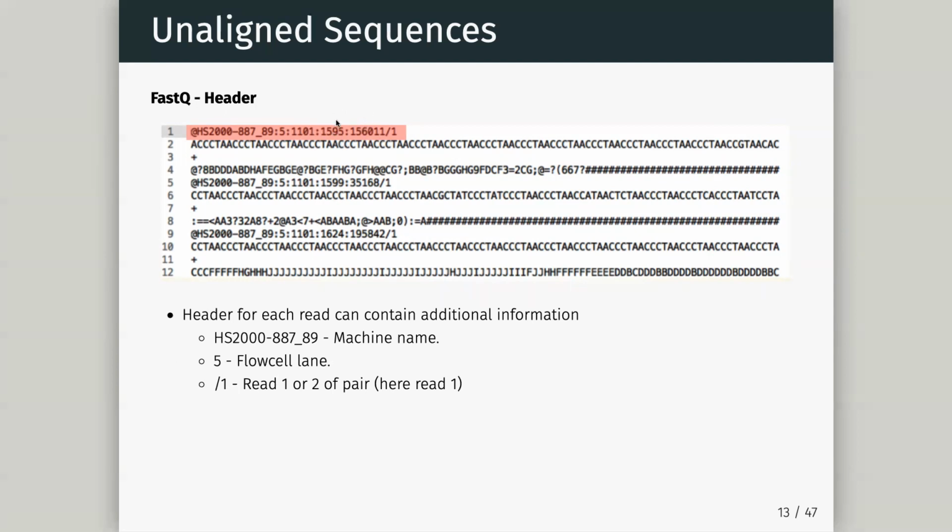The real importance of knowing where this read was generated really is if I start to see lots of low qualities and all the reads are in the same place on my flow cell, that tells me I have a positional effect. Okay, so the top of my flow cell was ruined. I can actually extract the sum qualities. We'll do this later. I can sum up the qualities and find the position and say, this area of my flow cell was ruined. I throw away all the reads from there.